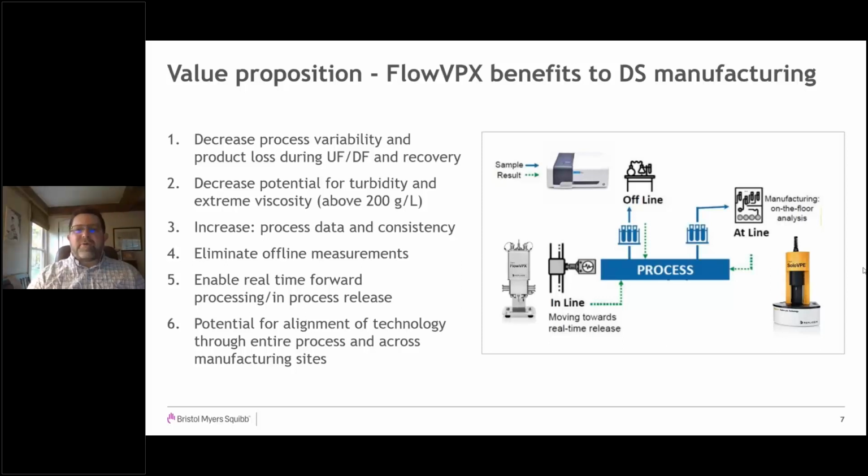So that contributes to potential error in the estimation of your concentration at the UF2 point. That's why an inline measurement of the entire bulk solution of the system is a much more intelligent and accurate way of doing it than based on mass.